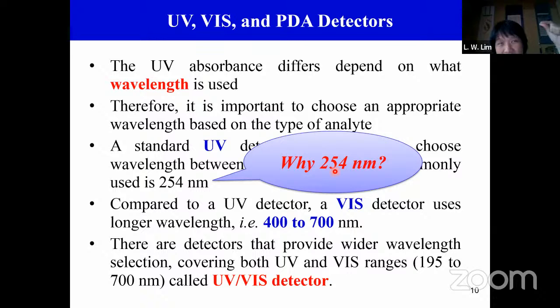used a source of light, because you have to give a light source for the UV. At that time, they used mercury. So a mercury light has only one wavelength which is so bright, at 254. Now, because of the regulations, everybody tries not to use mercury.